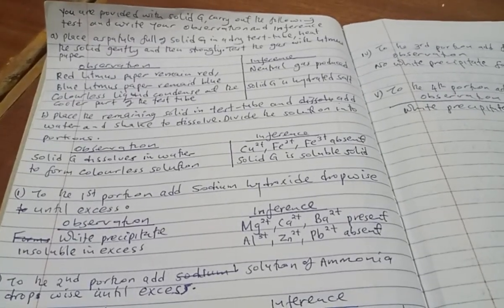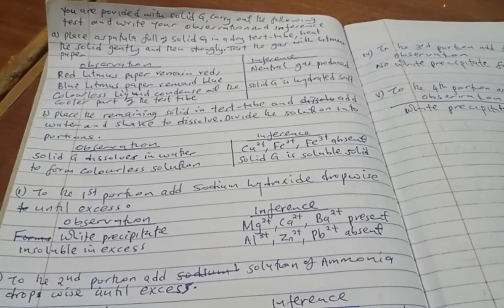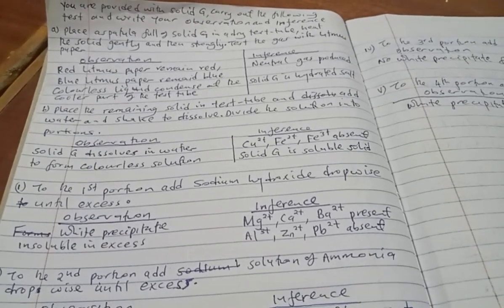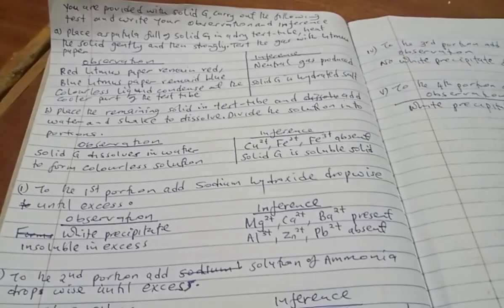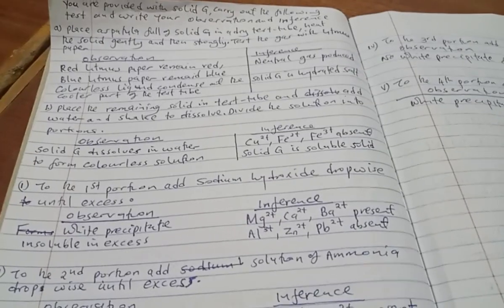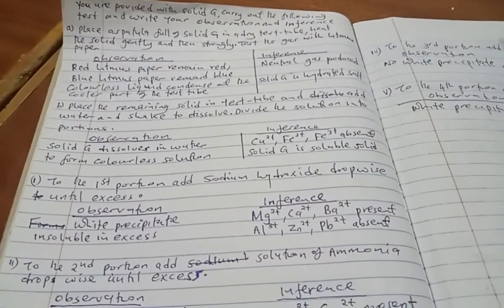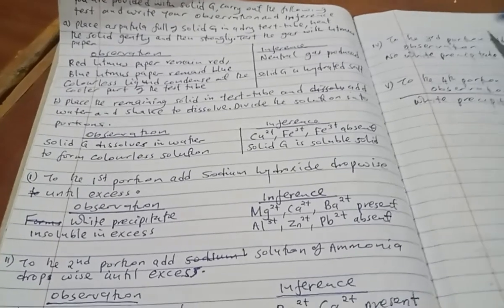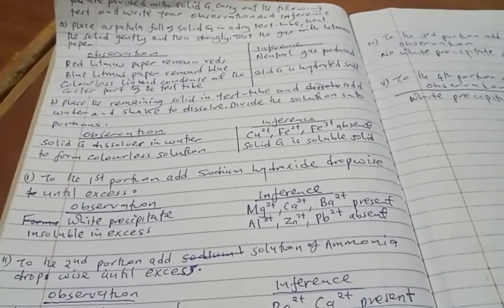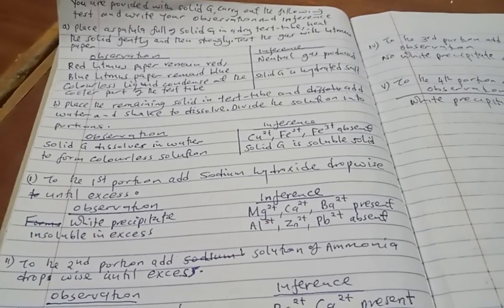Then the remaining portion, you can be told to put in a test tube, add water and shake. Then you divide the solution into several portions depending on the question. So in this case, what do you observe? When you are dissolving, you need to tell us whether it is a soluble or insoluble salt, and you need to tell us the color of the solution. For example, in this case, solid G dissolves in water to form a colorless solution.